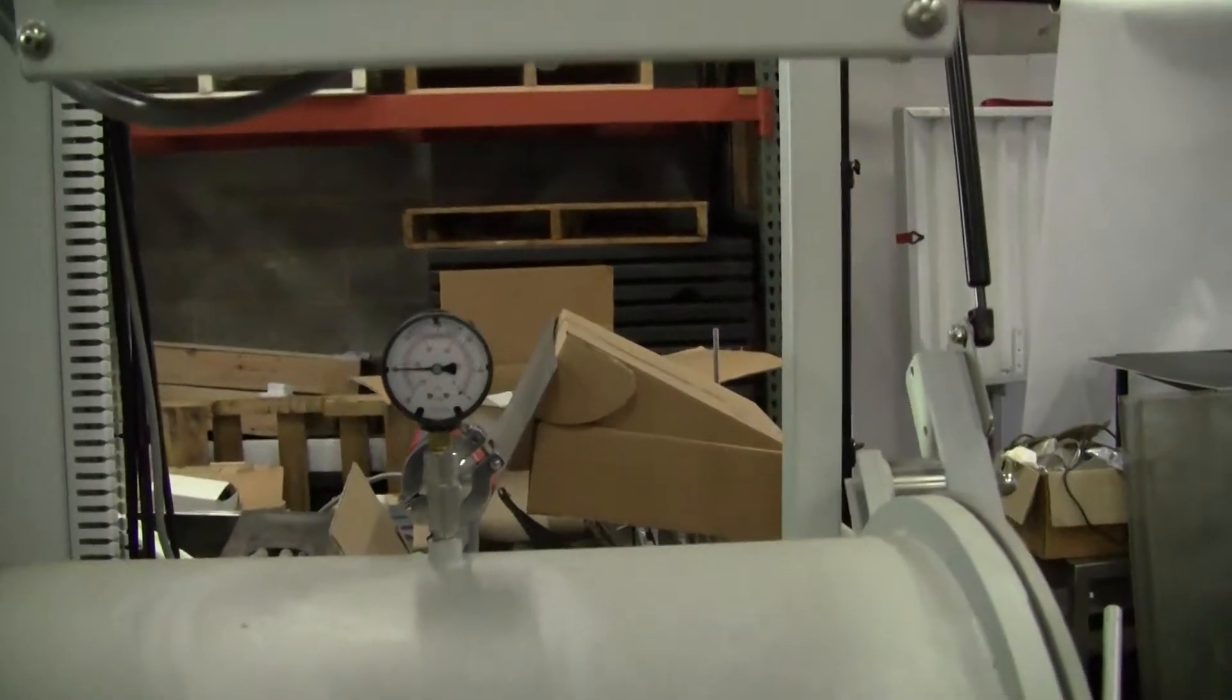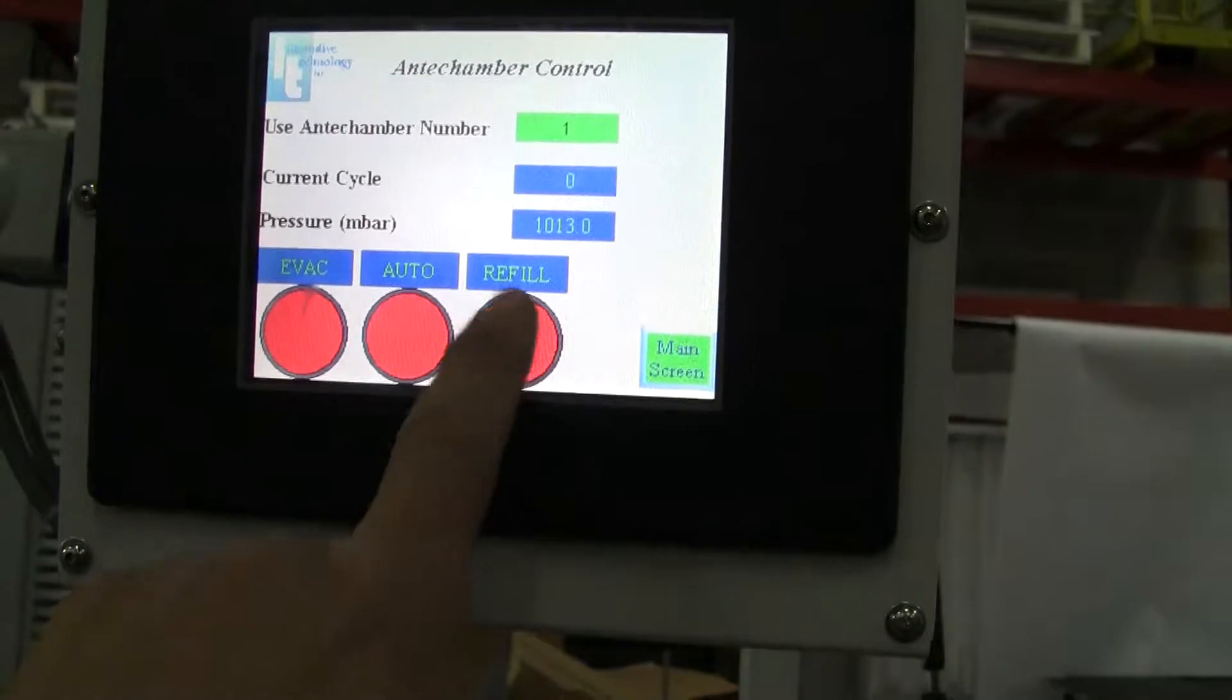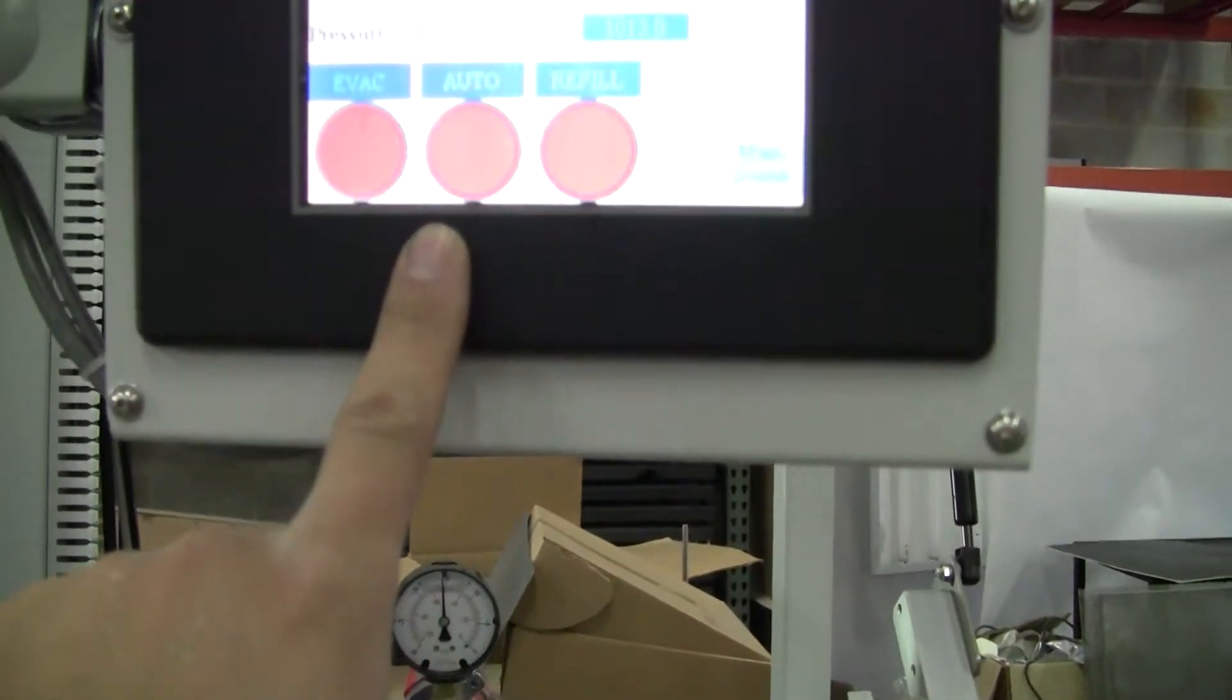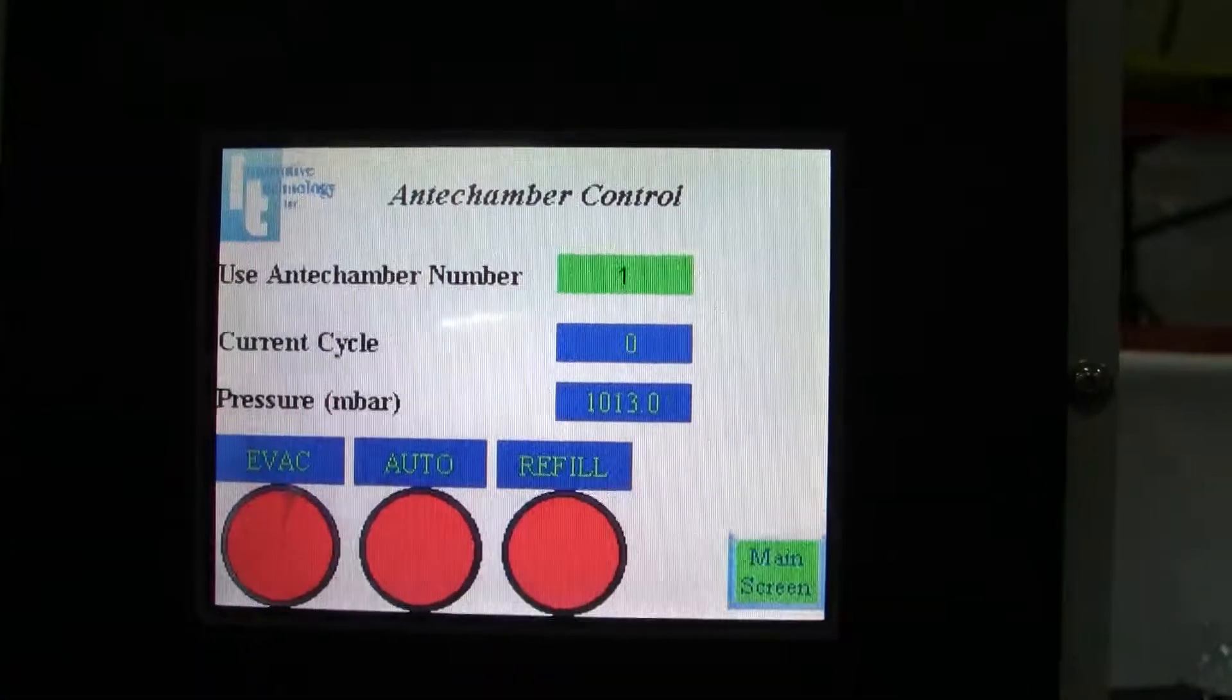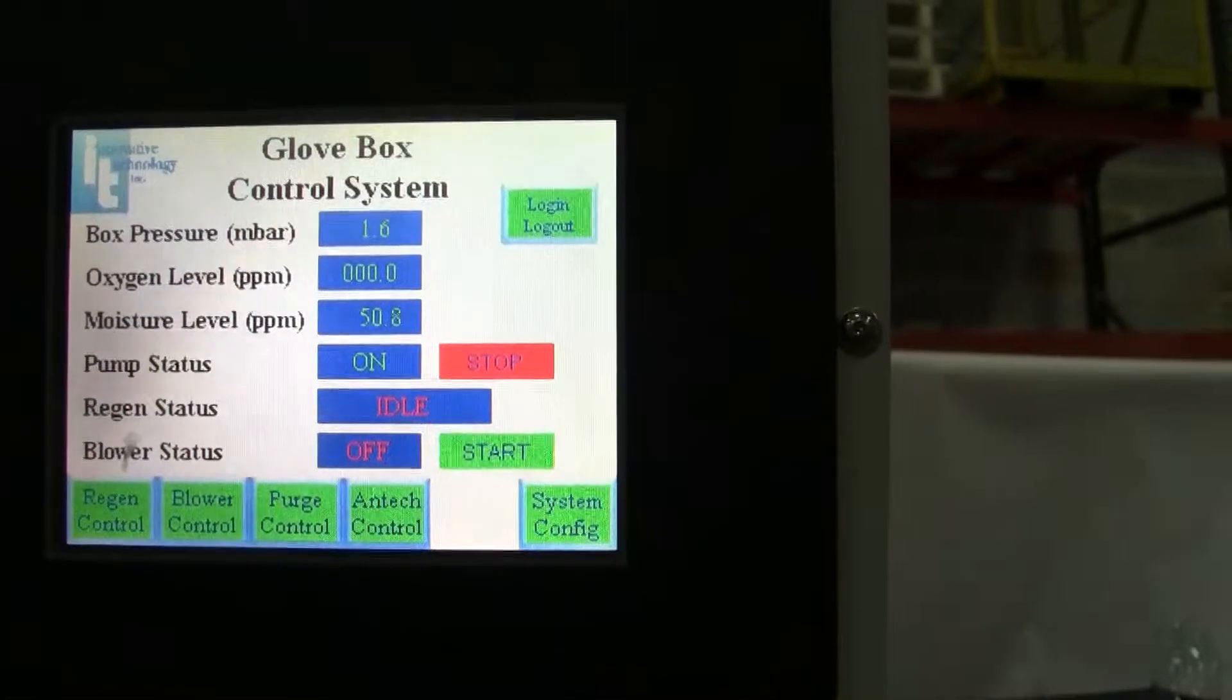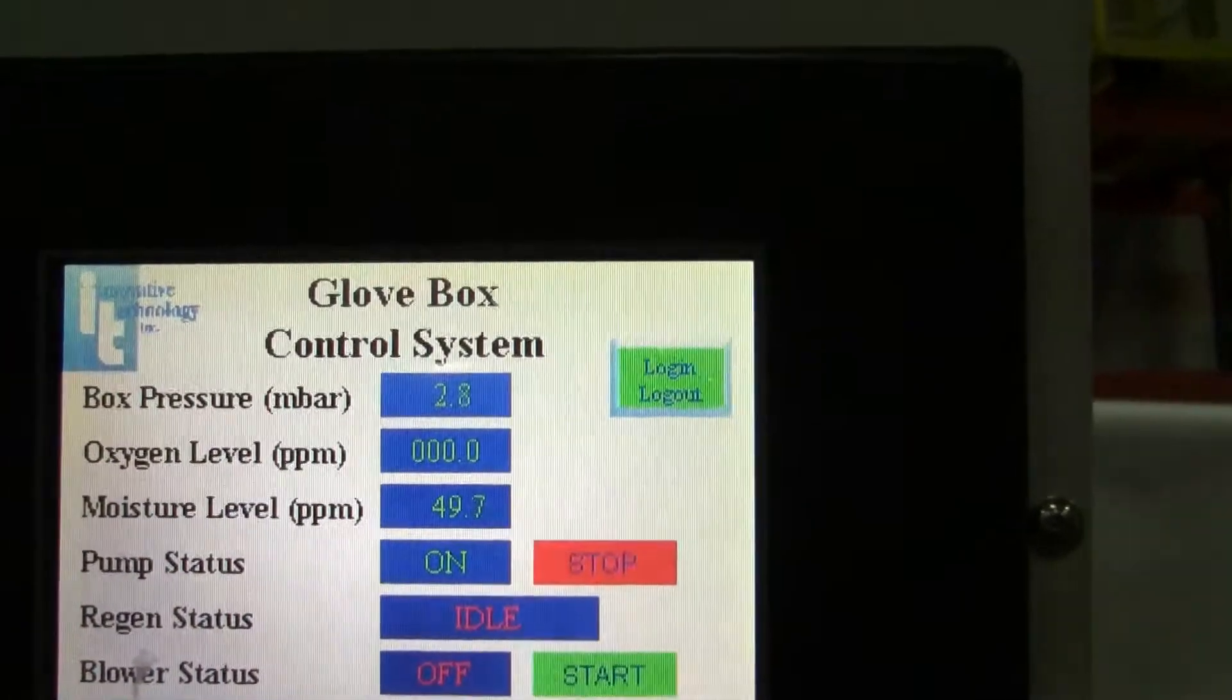An example of how this particular unit works. Nice touch screen. I'm just trying to maintain a box pressure of about 3 millibar.